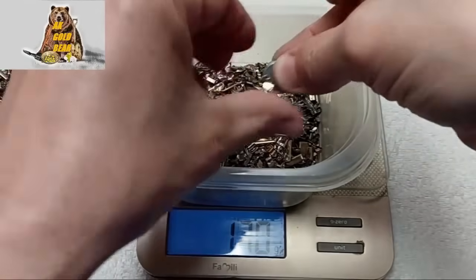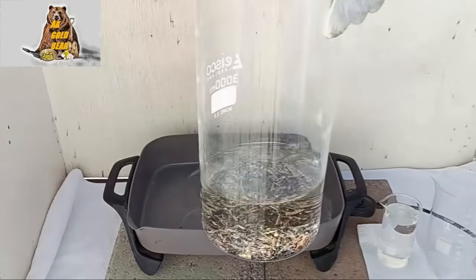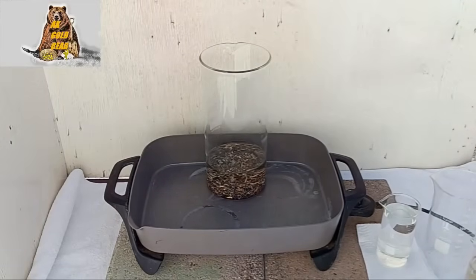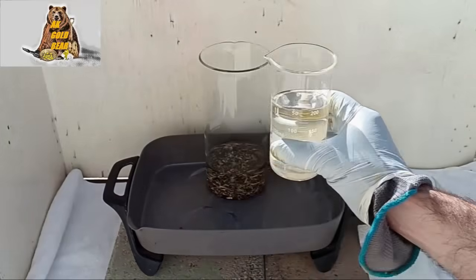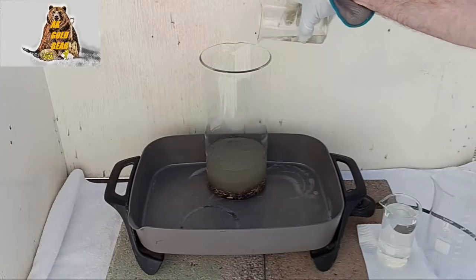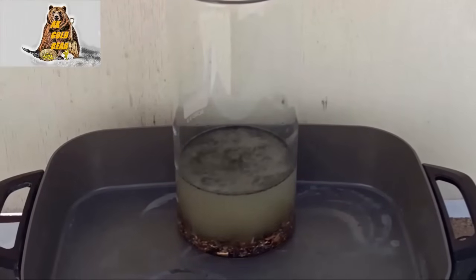I'll have to use electrolyte today. The material is in the beaker and I have already added 750 ml of water. Now I need 200 ml of sulfuric acid to get the electrolyte. The solution reaction started right away because the material is magnetic.